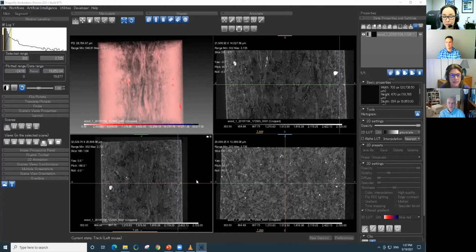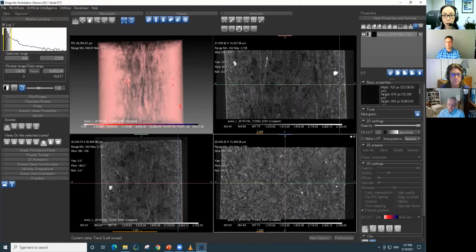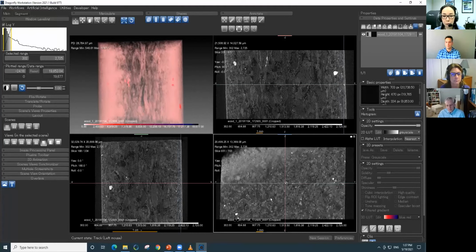So in this case, the most popular choice was to run slice analysis on the wood segment. Okay, I'm going to say that makes sense. So let's do that. Slice analysis, for people who might have selected the other two choices or are not familiar with this technique, is to take one slice and calculate a certain property on that slice, and you do that for multiple slices. So in this case, we want to calculate the packing density of this slice we're looking at in the right bottom corner, and do that for different slices one by one.